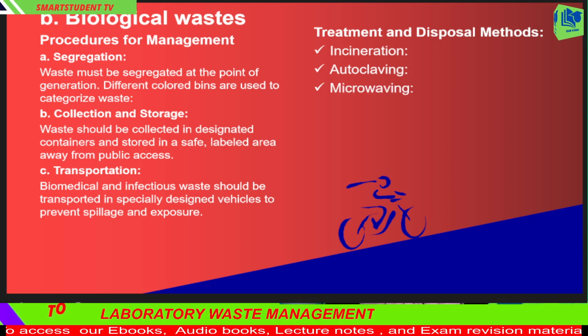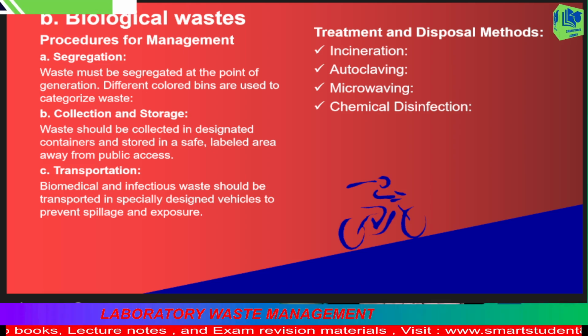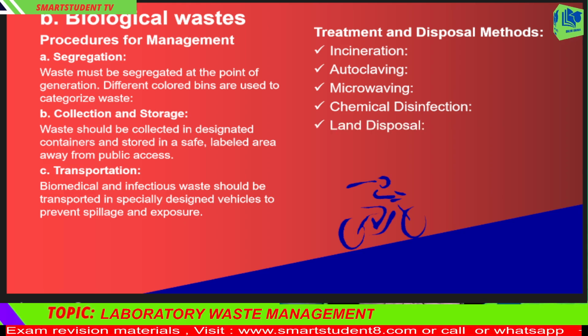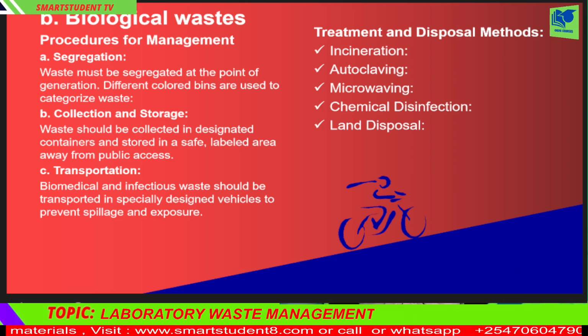3. Microwaving. This method is specifically used to reduce microbial load on an item or media. 4. Chemical disinfection. This method is specifically applied to liquid waste, infectious waste, and sharps. 5. Land disposal. In this method, a secured landfill is identified and used for disposal of non-hazardous waste.